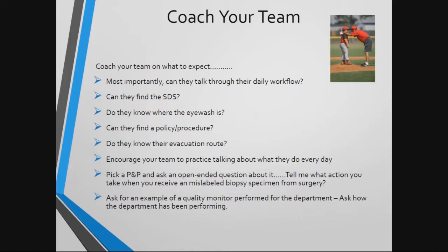Ask your staff to talk through their daily tasks. For example, ask them to walk you through their process when they receive a specimen in the gross room. What steps do they take after it is delivered? Inquire if they know how to find an alcohol or formalin safety data sheet in the event of a spill. Do they know where the eye wash is? Should they splash it in their eyes? Are they familiar with the evacuation plan? Do they know where to go? Do they know where to find it? Can they demonstrate how to find a policy or procedure of their choice?